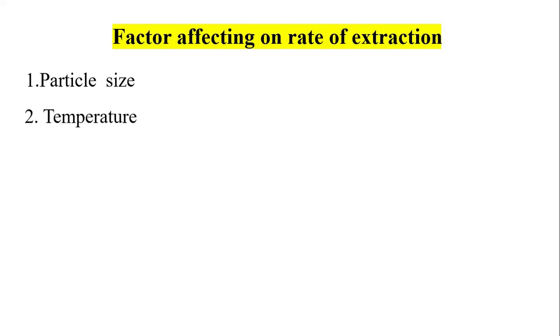Second one is the temperature. Up to a certain limit, as we increase the temperature of the solvent, the penetration power of the solvent is increased, and because of which the extraction of the active chemical component is maximum in the process.